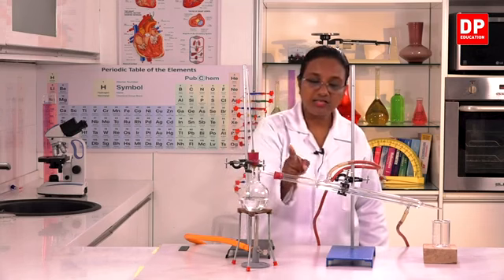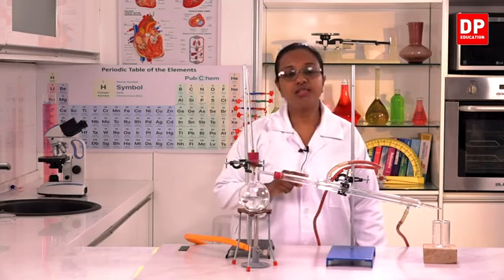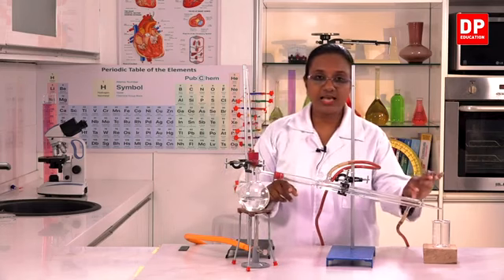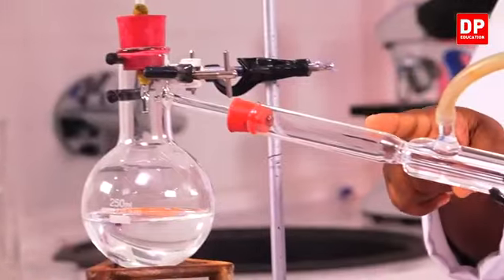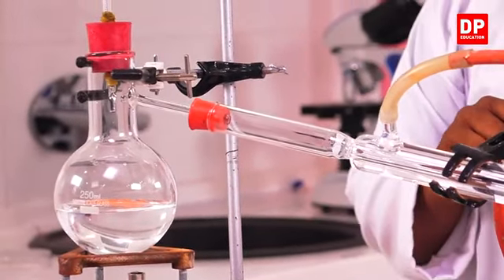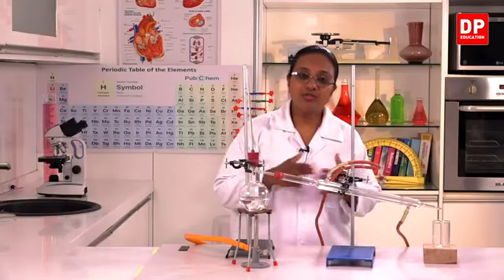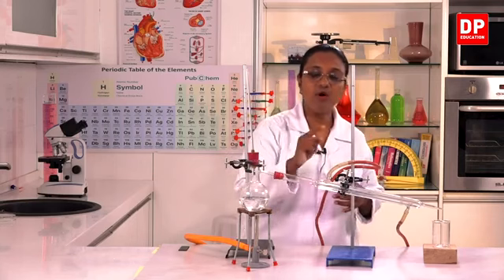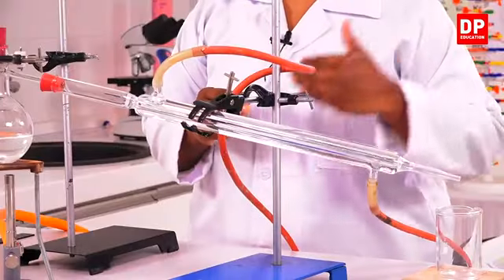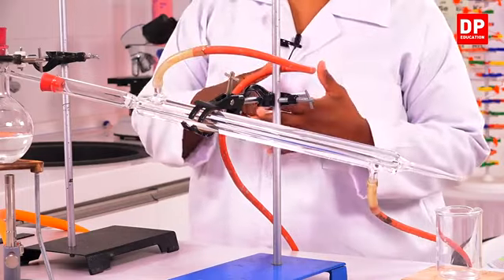Then this part is connected to the condenser. This condenser is called the Liebig's condenser, and this is a tube inside and an outer casing, and also there are 2 points to send water in and to collect water out. Now students, if we send the water from the top opening, the opening that is here, what do you think will happen? This is placed in an inclination.